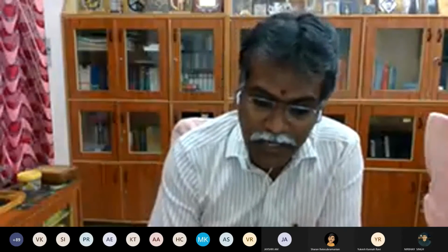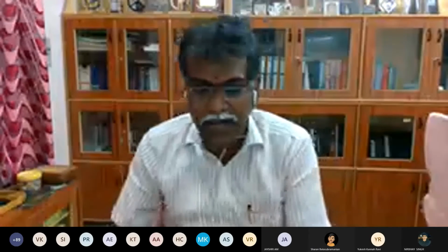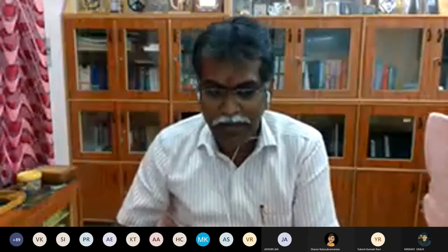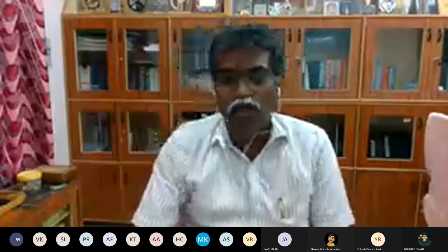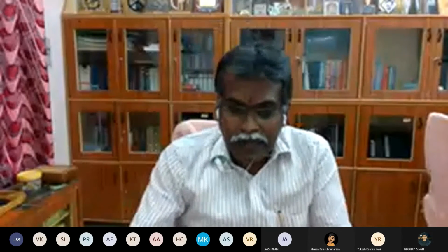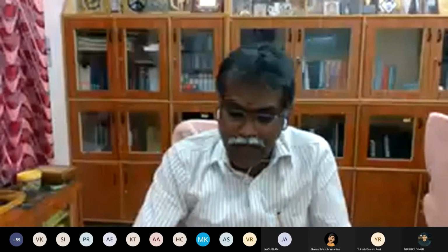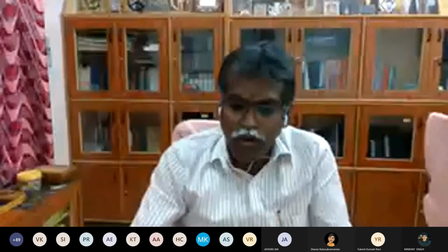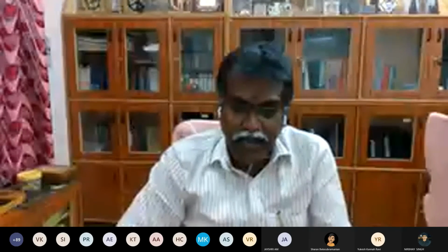In natural water bodies, turbidity may sometimes impart a brown or other color to the water. The main problem with turbidity is color. You may get brown water, yellow-tinted water, or sometimes milky white water. That is because of these turbidity-causing agents. And the main important problem of turbidity in huge water bodies is that it will not allow the light to penetrate inside.